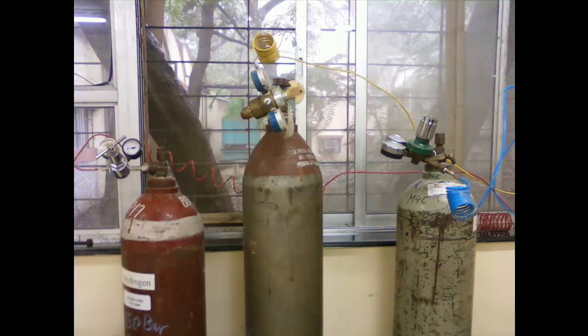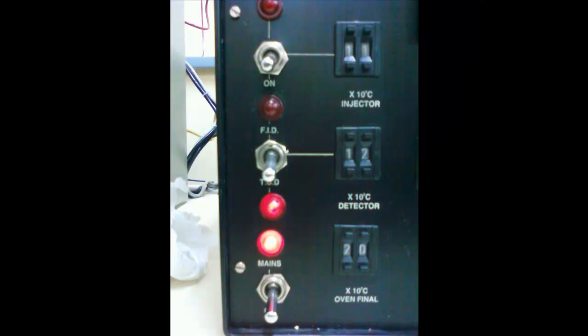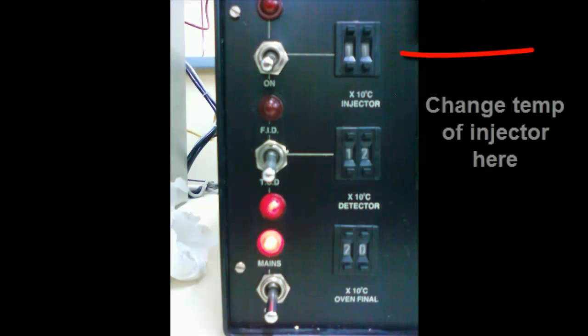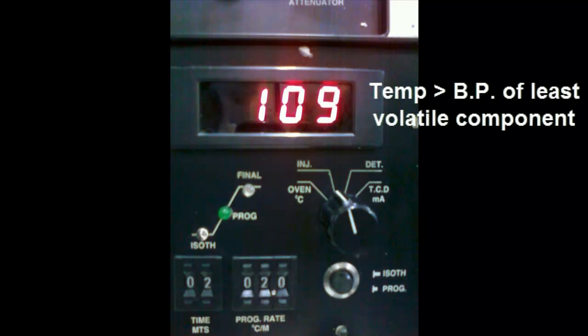The carrier gas for the GC experiment is hydrogen. After injection of the sample into GC, the sample is carried through the column by the hydrogen gas. The temperature of the injector is kept at a temperature above the boiling point of the least volatile component.